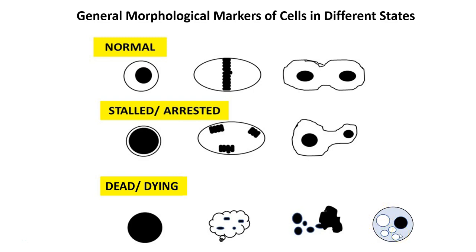At a later stage, if it is a necrotic cell, the cell would be expanding in size. So it will be a really large cell as it gets ready to burst and get destroyed. And if it is autophagy, the cell would be shrinking in size and becoming smaller until there is almost nothing left in there except the nucleus.